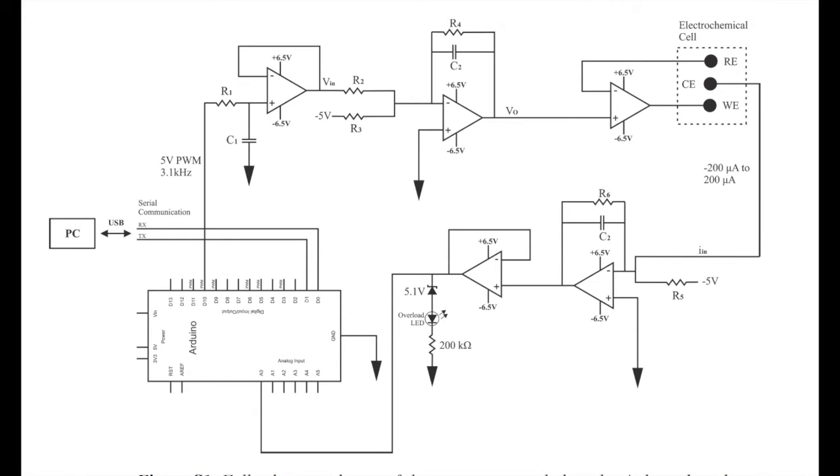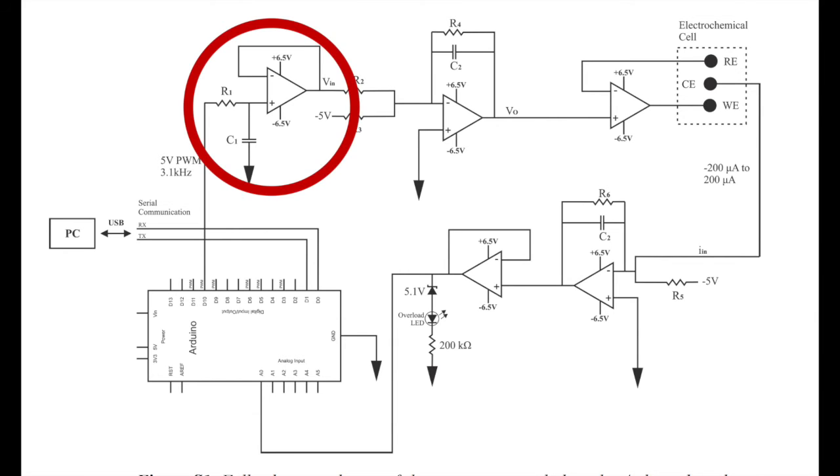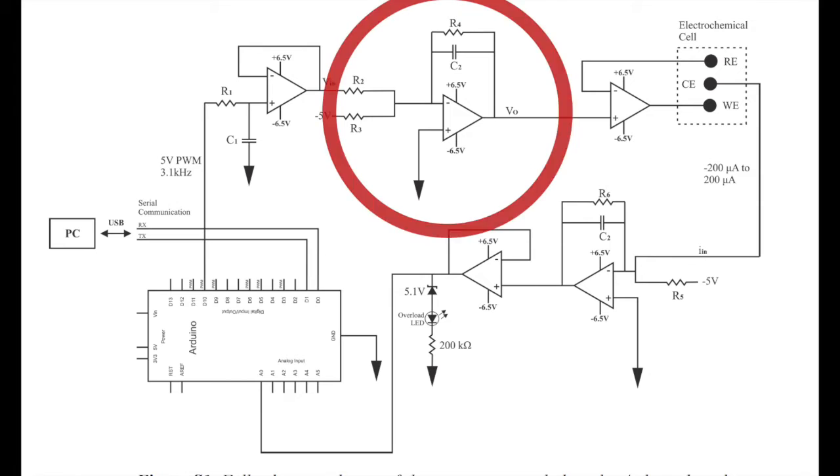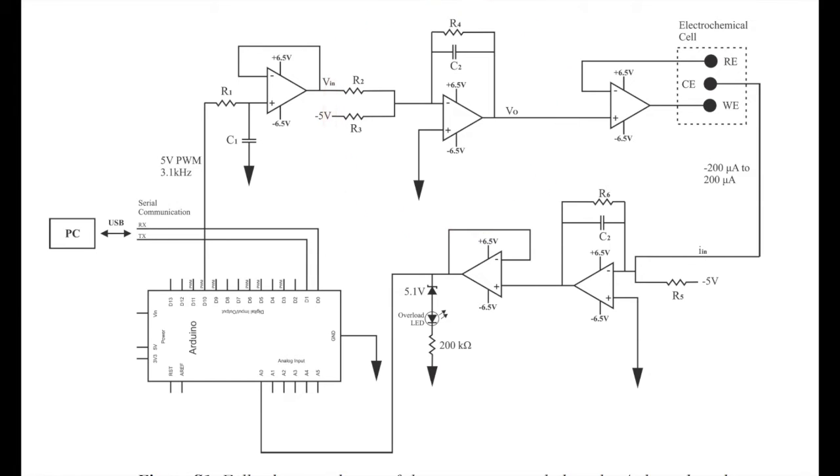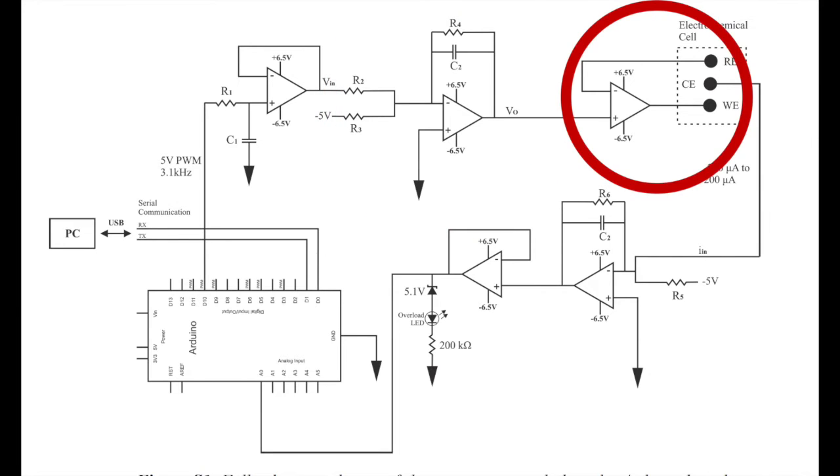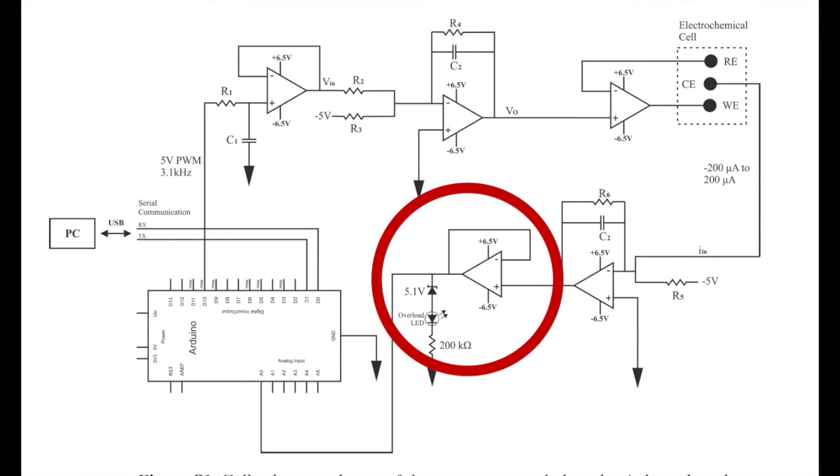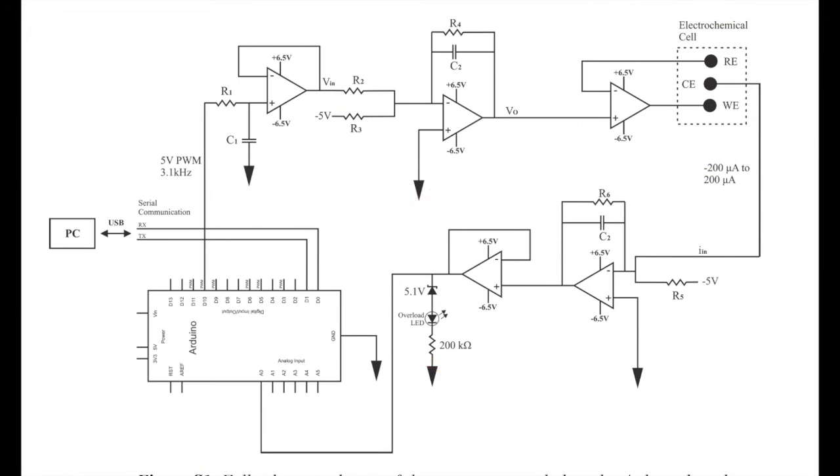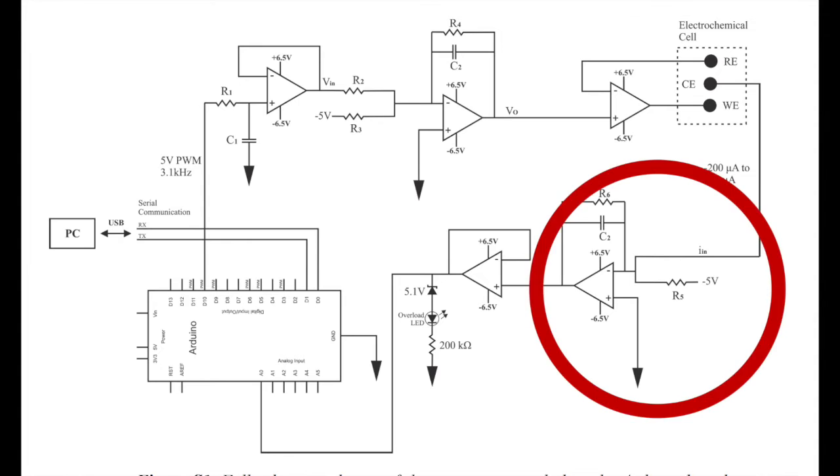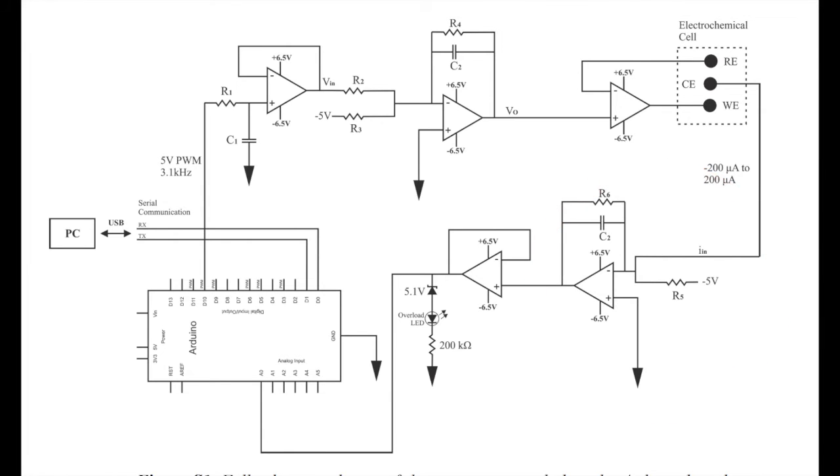Here is an overview of the potentiostat circuit that we will be assembling. Although it looks quite complicated, we will go through it together and its assembly. The first component here is the DAC, or digital-to-analog converter. Then we have the summing amplifier, the electrochemical cell, the analog-to-digital converter, and the transimpedance amplifier.